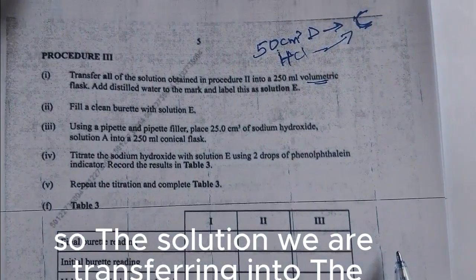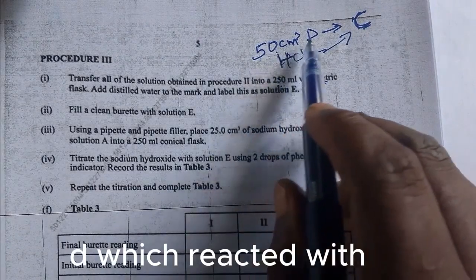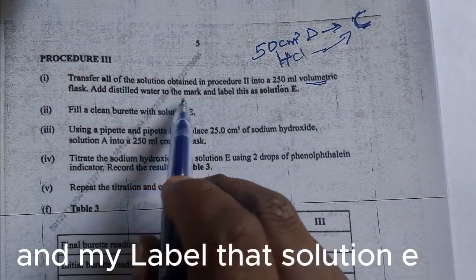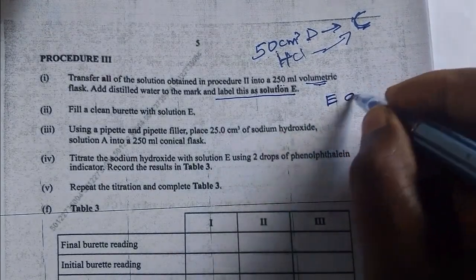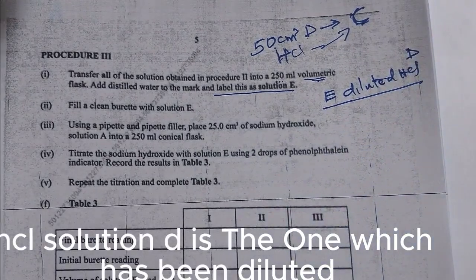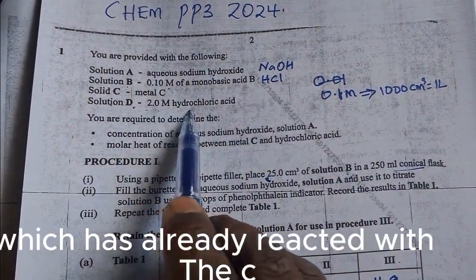So the solution we are transferring into the volumetric flask, 250 centimeters cube, is solution D, which reacted with solid C. So add distilled water to the mark and label that solution E. So solution E is diluted HCl. Remember that. HCl solution D is the one which has been diluted. Because you remember solution D was 2 molar hydrochloric acid, which has already reacted with C.